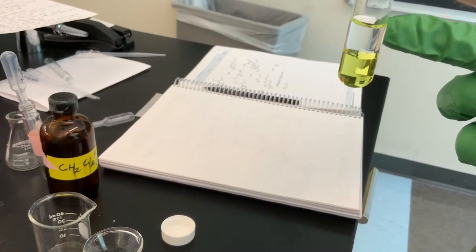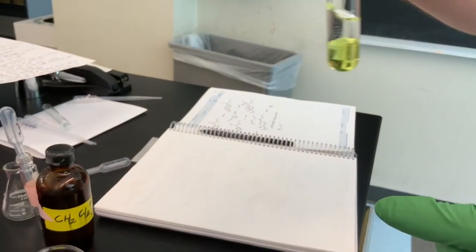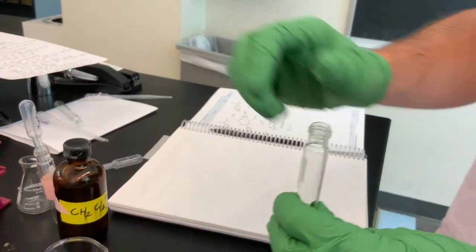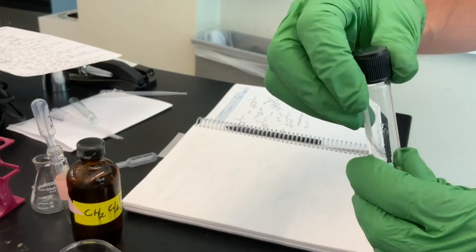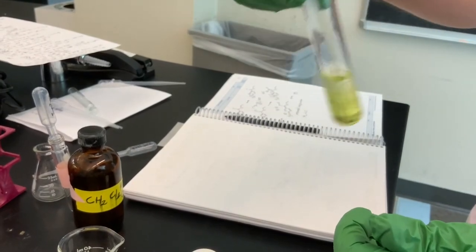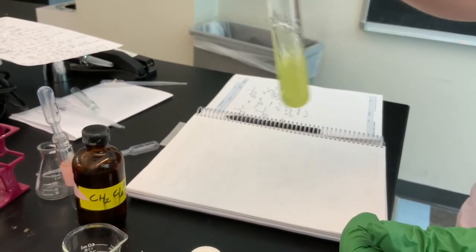Right now, our pH, of course, is very low because we've got 3 molar hydrochloric acid. So what's happening now as I mix this is that the benzocaine will be protonated, and the salt then will be more soluble in the aqueous layer. So we've got caps for these culture tubes, but they tend to leak. So I'm not gonna shake it up and down like I did before with my 5 milliliter reaction vial when we did the partition coefficient, but rather I'm just gonna do it this way. And this is still good enough.